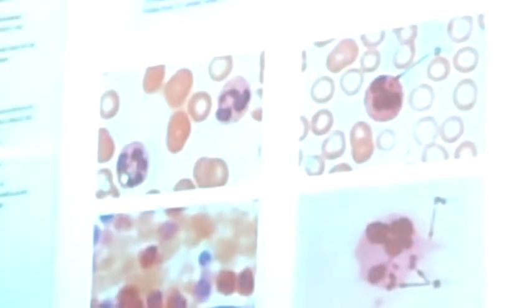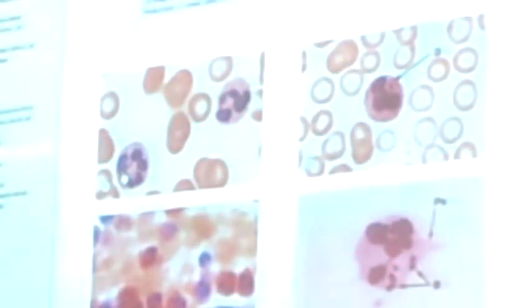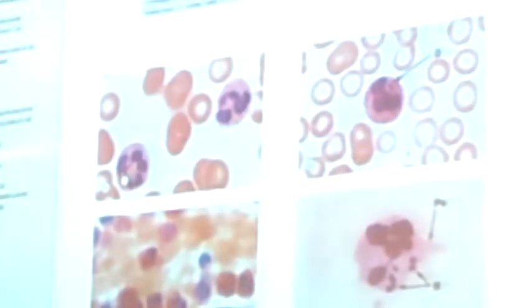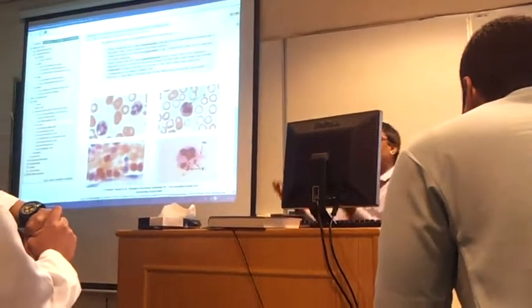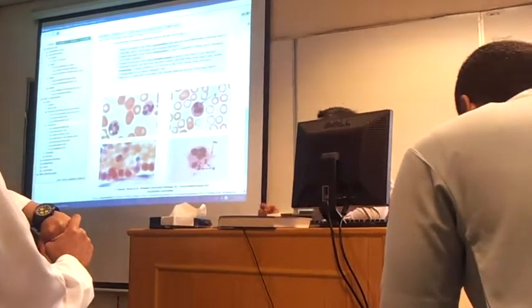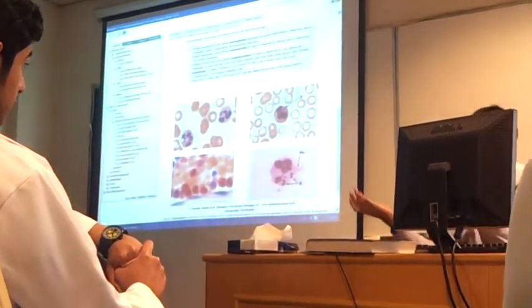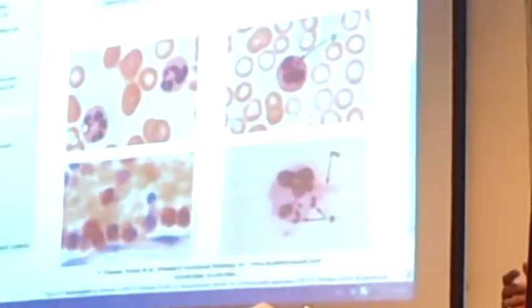Questions that could be asked: what type of granules does it have? Neutrophils have three types of granules called azurophilic granules, which take a purple color. There are primary, secondary, and tertiary granules. You should know what enzymes are present inside each. Which are the biggest? The biggest are the primary granules. The azurophilic spot is important to recognize.